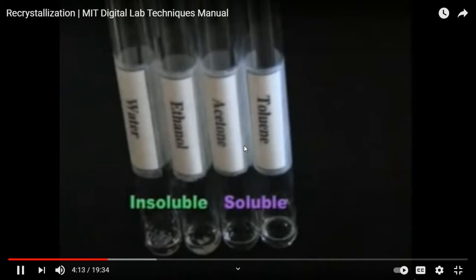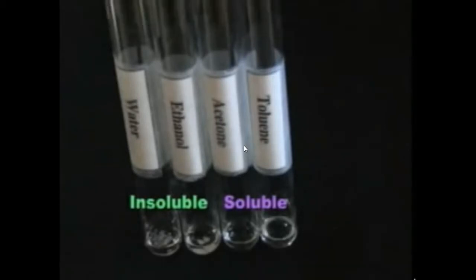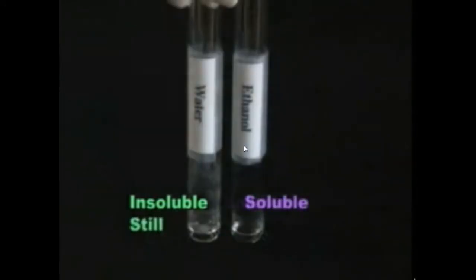Remember, at room temperature, naphthalene was soluble in both toluene and acetone, so neither of these will work. After heating, naphthalene remained insoluble in water, even at the boiling point. This means that ethanol is the solvent of choice. It dissolves the sample at its boiling point, but not at room temperature.